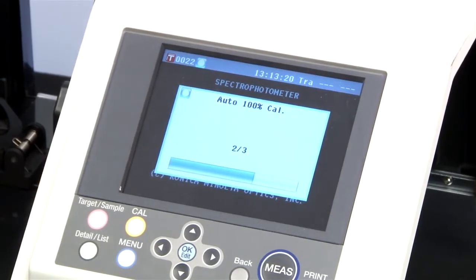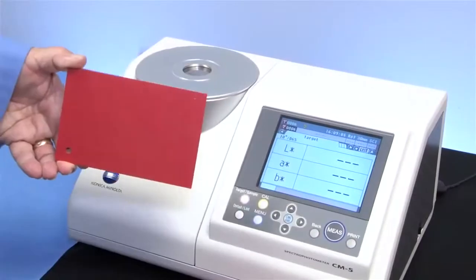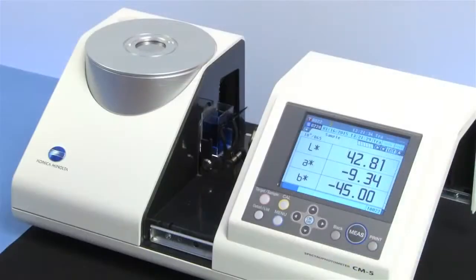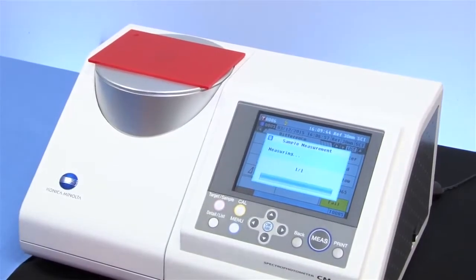After calibration, place your sample on the top port or in the selected transmittance sample holder and press the measurement button. What could be easier?